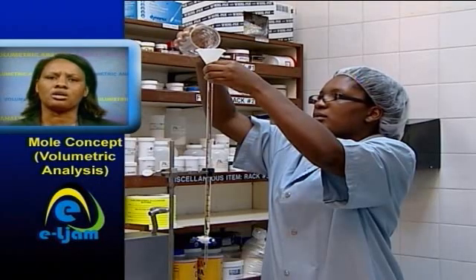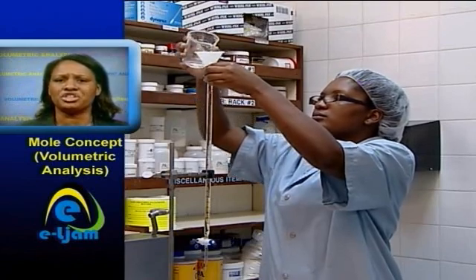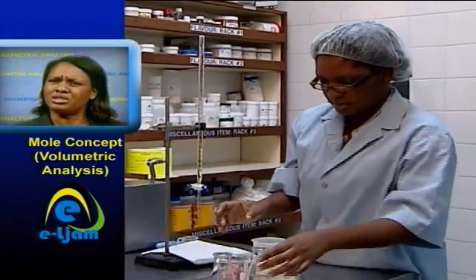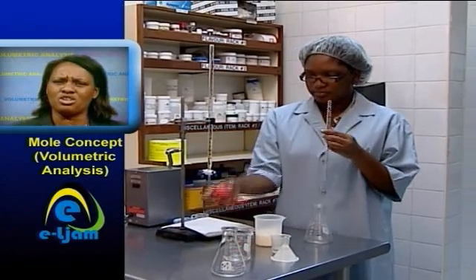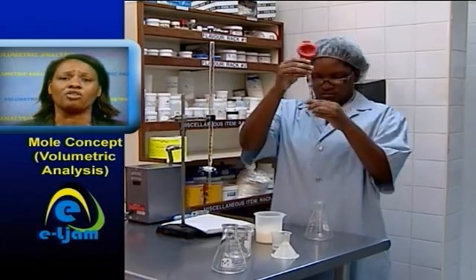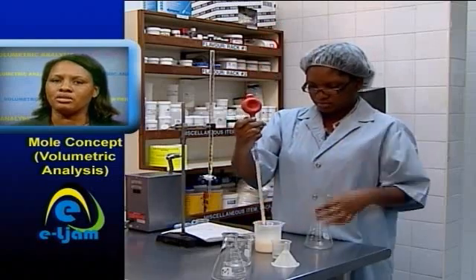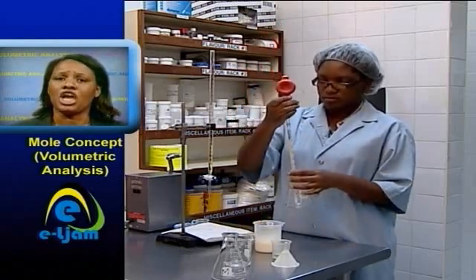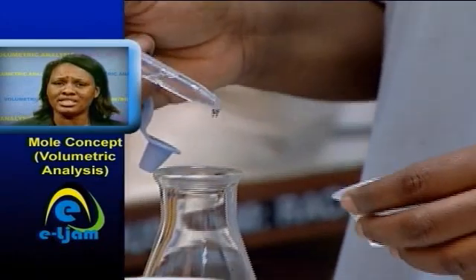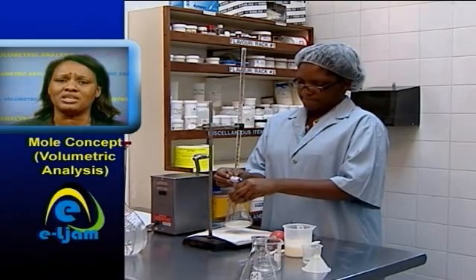Volumetric analysis is a common laboratory method of quantitative analysis that can be used to determine the concentration of a known reactant. The term titrometric analysis is more commonly used today to refer to volumetric analyses carried out by way of titrations. Titrometric analysis is carried out by determining the volume of a solution of accurately known concentration, which is required to react quantitatively with an accurately measured volume of the substance to be determined.